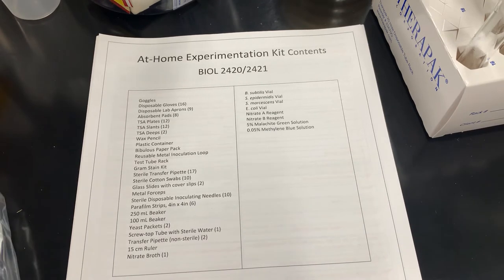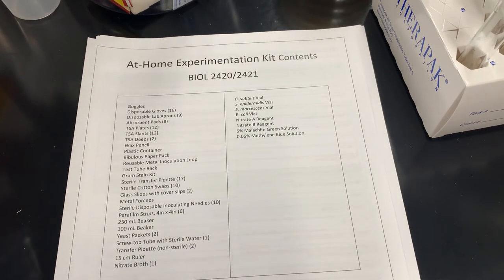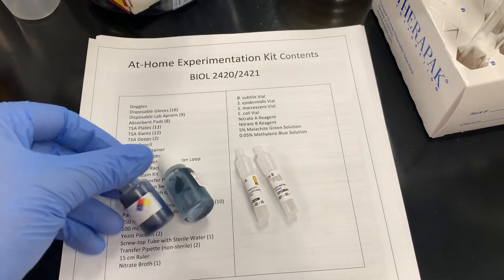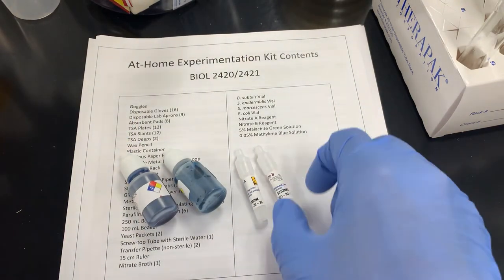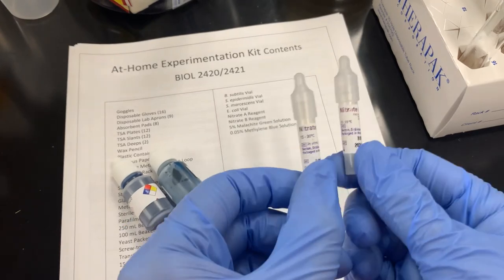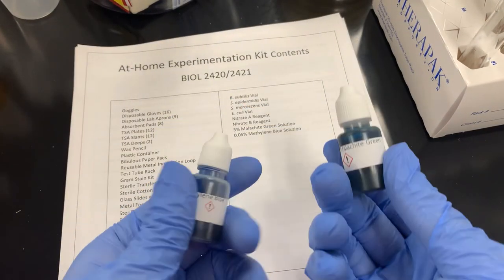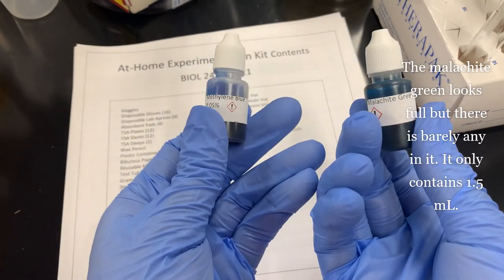Now, last few things here. Are also in the plastic baggie. You have 2 little dropper bottles. Now, this is going to be used for the nitrate experiment, okay? It says nitrate A and nitrate B. These are malachite green and methylene blue.